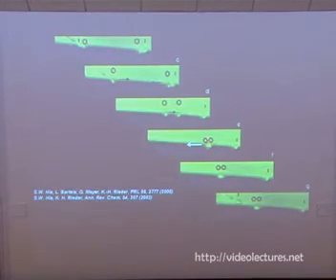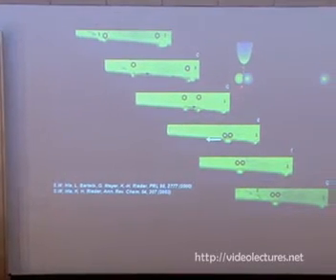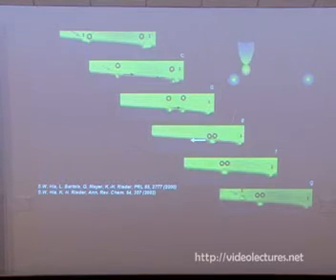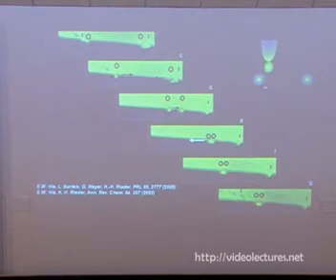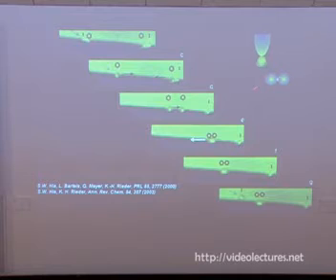Finally, here we inject the tunneling electrons and join them, and move it to check the stability and put the iodine atom back. I will show you with a small cartoon here. We inject the electrons to break the iodobenzene, pick up the iodine atom with the tip, and move the benzene rings close to one another. This is actually how the tip is moving during the process. Inject the electrons to weld the benzene rings, and then move the entire molecule to test how stable it is and put the atoms back here.